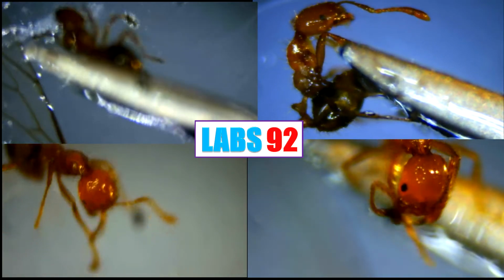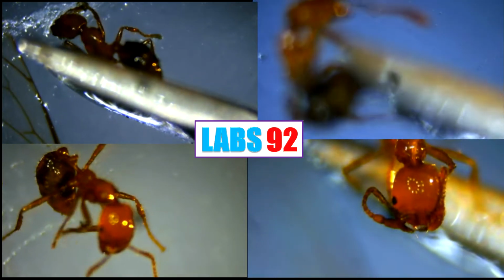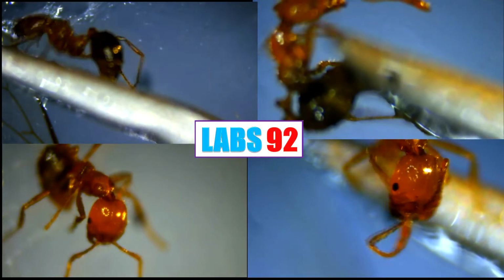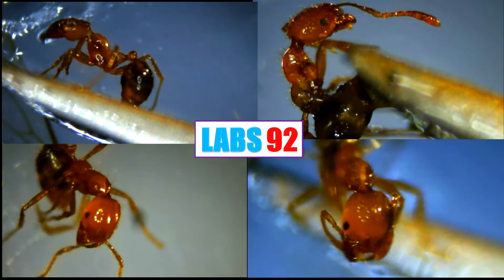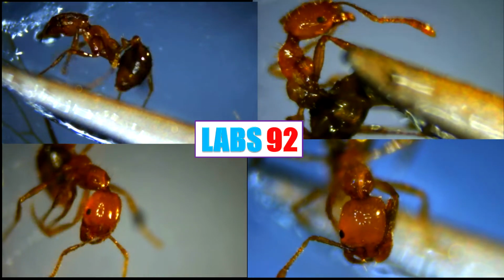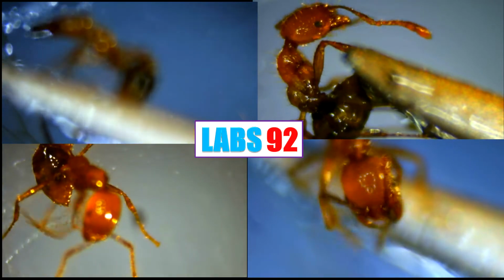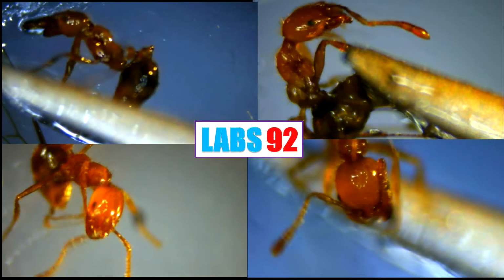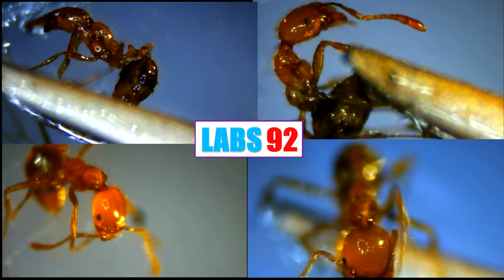You can see 4 ants in the video, but it's just the same ant. I use several methods to capture the movement of the ant. The ant is very fast, so I just added a little oil on it, so the ant cannot move so fast, so that you all can see the ant better. You can see clearly the head, its forelegs, its middle legs, its hind legs, and its sting.